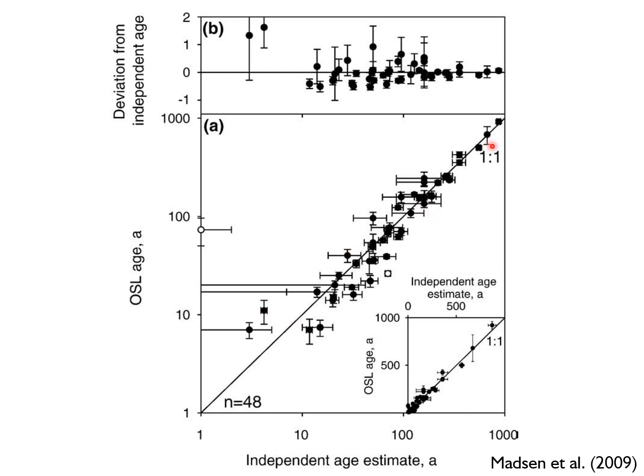And what we can see here is that it looks quite good. We do not see any obvious offset in the data, and so we feel confident that at time 0 the signal is 0.